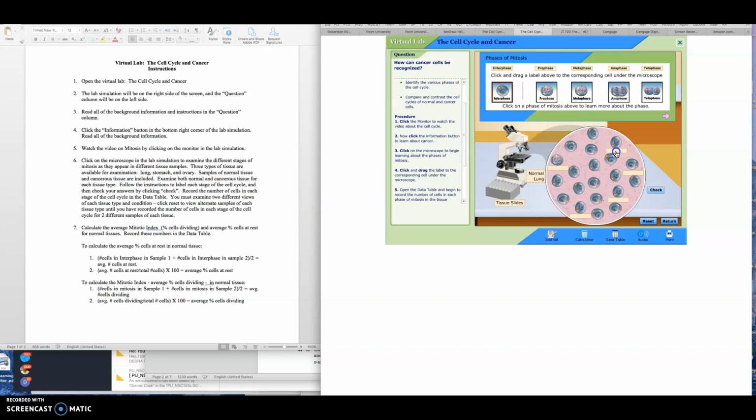I think these are interphase. Well, I guess that sound is wrong. We just got, looks like one dividing cell here. So the others should be in interphase.